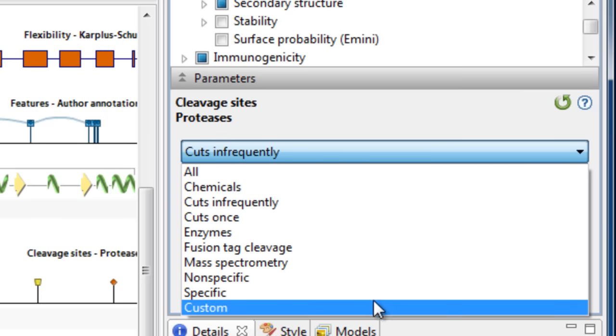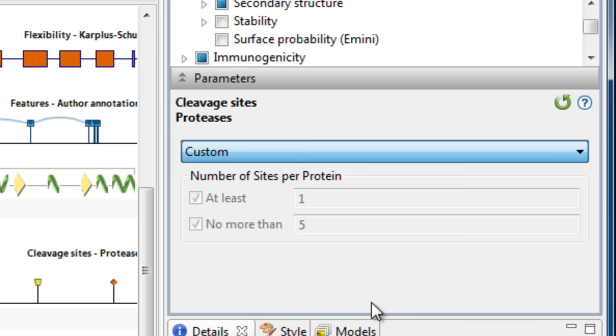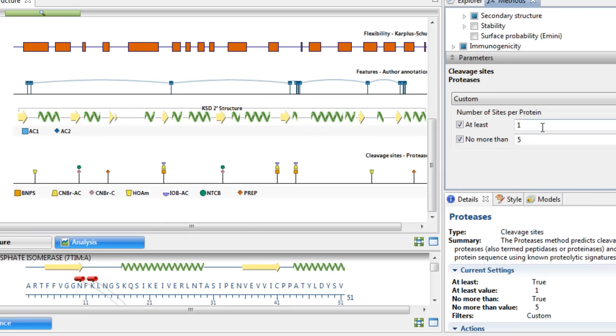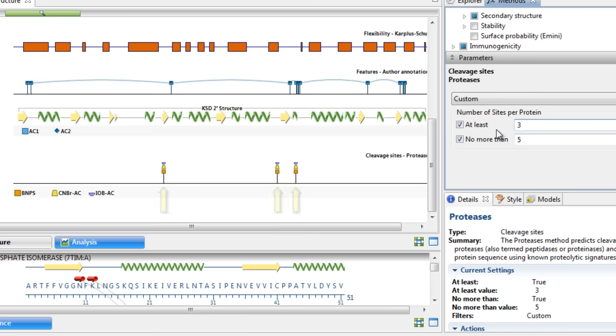Selecting the Custom filter allows you to define the number of cleavage sites manually. For example, if we want to look for proteases that have at least three, but no more than five sites per protein, we can see that the Analysis view will update to reflect this filter.